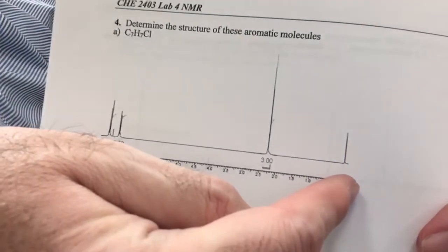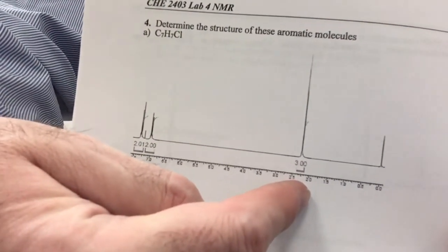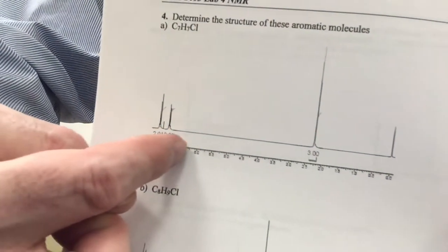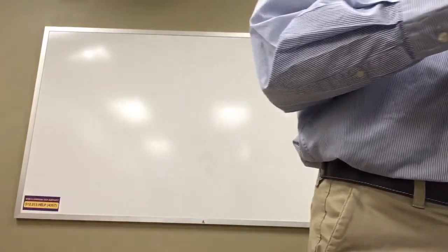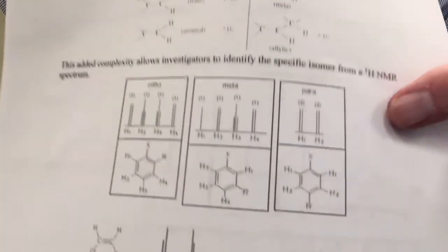That's tetramethylsilane, so that one doesn't count. Then there is a signal here. That counts. And then, is this either 2 separate signals, or is that one signal with a very wide coupling constant? And it depends on your perspective, which in turn will depend, have you read this page?